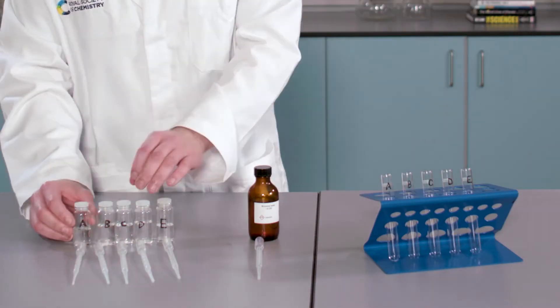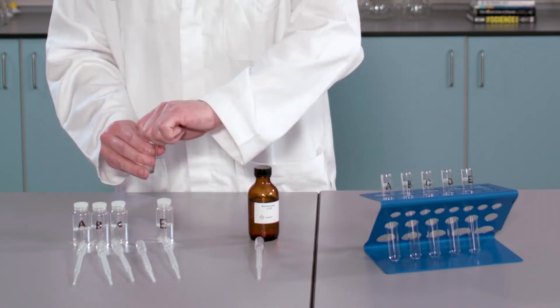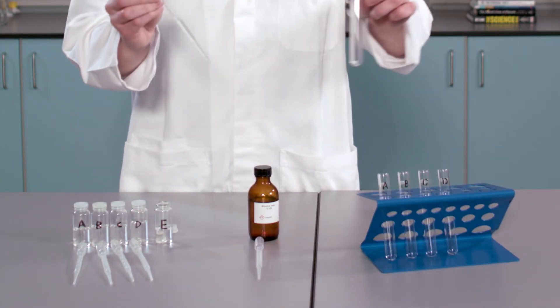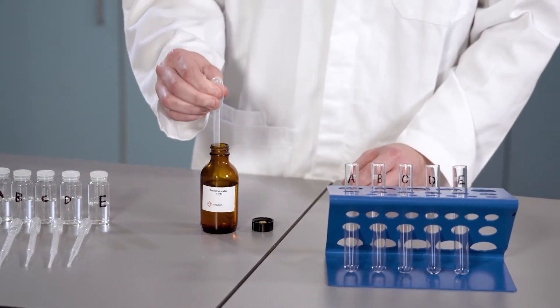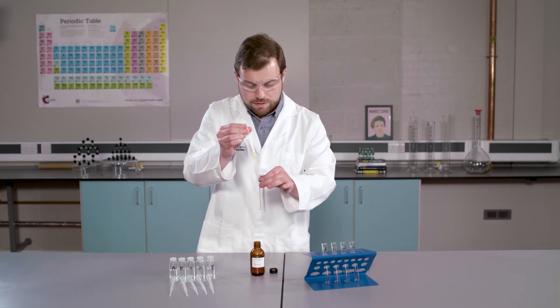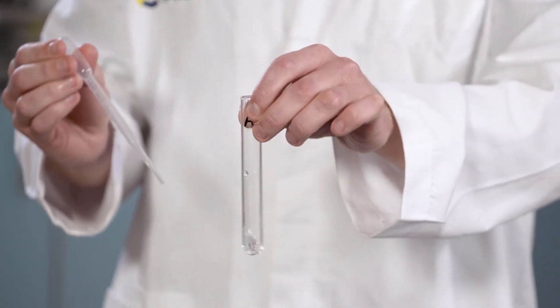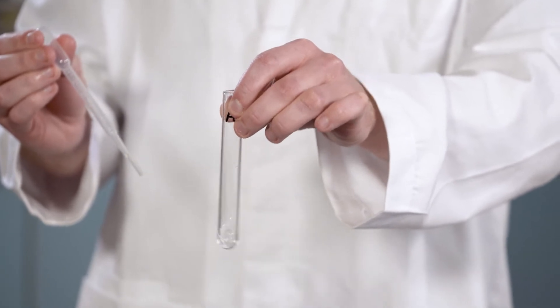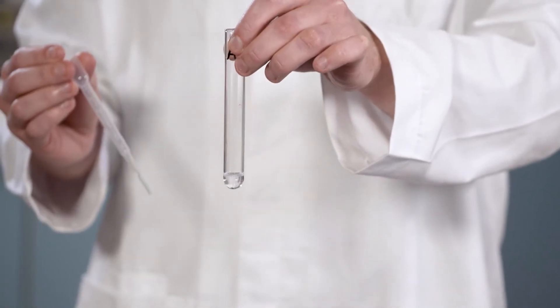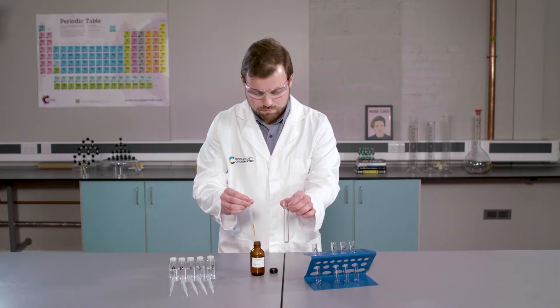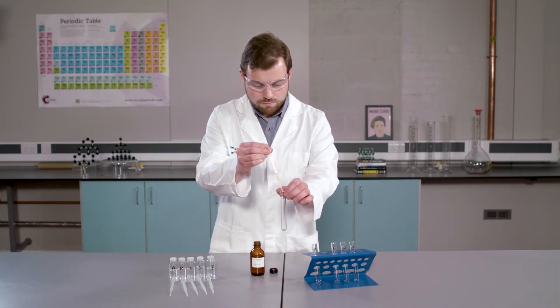First, I am adding a few drops of each sample, A to E, to a labelled test tube. Now, add one centimetre cubed of bromine water to each sample, and shake vigorously from side to side. You can see the bromine water has become colourless, a positive result. I am going to continue testing the rest of the unknown samples.